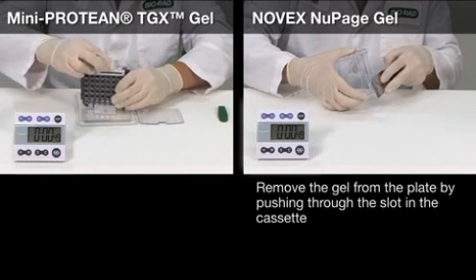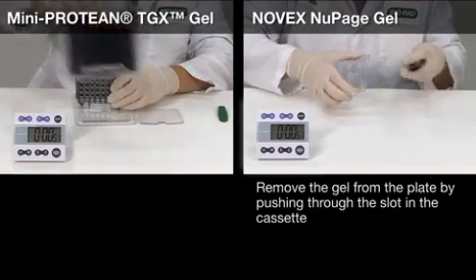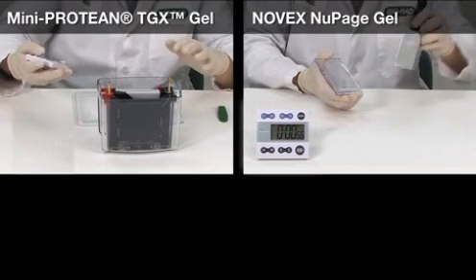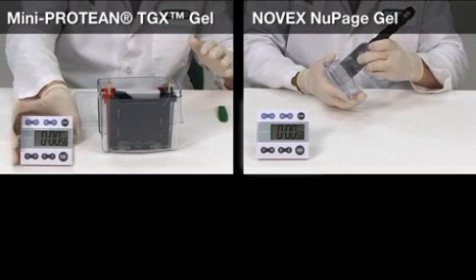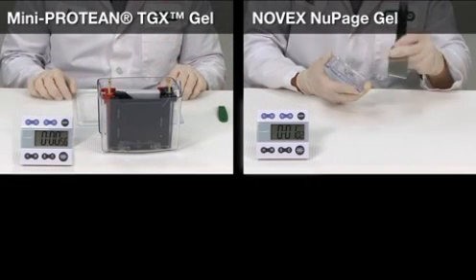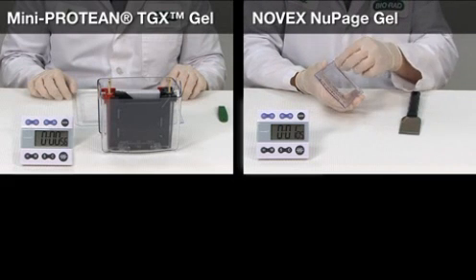The TGX gel is now ready to go into the mini transblot transfer cell. To prepare the Novex NewPage gel for blotting, you need to remove the bottom of the gel before you set up the transfer assembly.